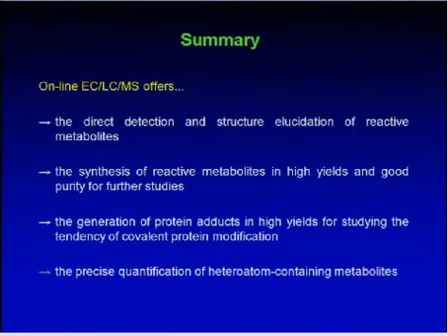So in many cases you're fully right, the stereoselectivity cannot be simulated, but also some of the things which are traditionally accepted for the liver cell microsomes are not really scientifically more sound than the electrochemistry, because the reactive metabolites cannot be simulated very well in these approaches. So I think both of these approaches have their justification, and I think the electrochemistry will not be able to replace the traditional approaches, but it's a very nicely complementary information, especially for rapid simulation of these reactions and also for the simulation of reactive metabolites.